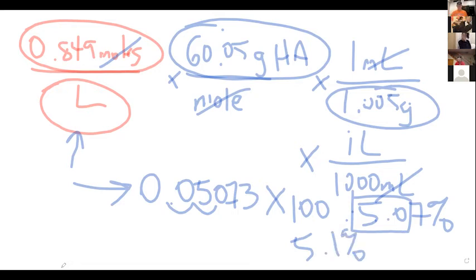So you can see that's pretty darn close to 5. Even though I went like 1 drop over, I still got a pretty good result. 5.1%, I wouldn't feel too bad about that. So what would be my relative error with 5.1% when I was expecting 5?